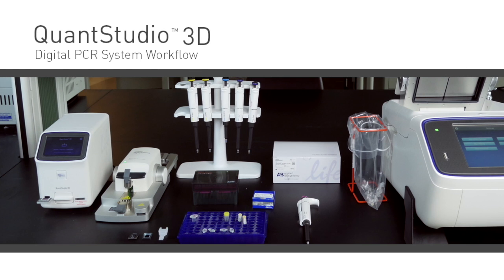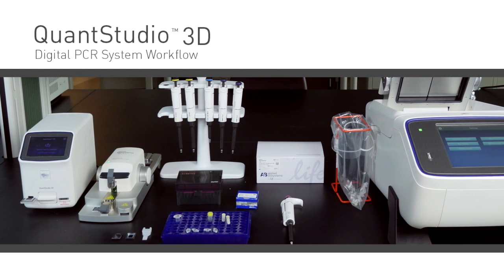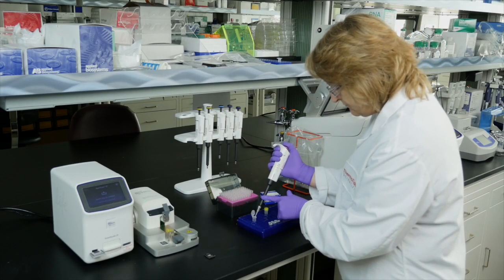Go from sample to answer with QuantStudio 3D Digital PCR system. The workflow is simple. Just prepare the reaction mixture.